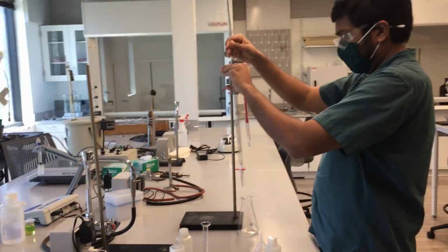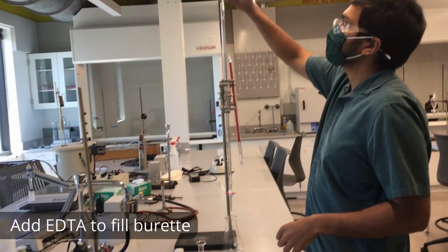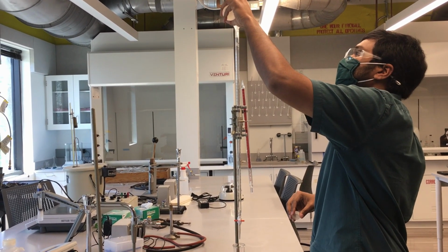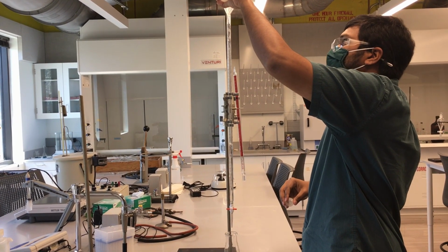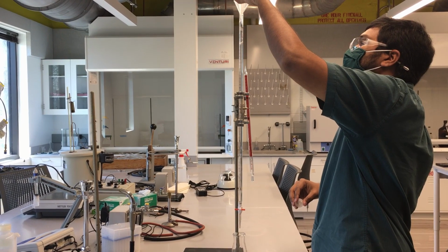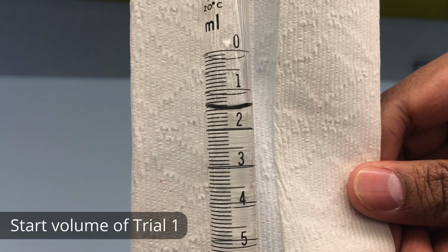Now that I've washed that burette, I can go ahead and start to add the majority of our EDTA solution to the burette itself. Now the burette holds a maximum of about 50 milliliters of fluid, so I'm going to try to utilize most of it while keeping inside the graduations. This allows me to measure the initial and final volumes whenever I'm doing the titration during the experiment. There you can see my initial volume.